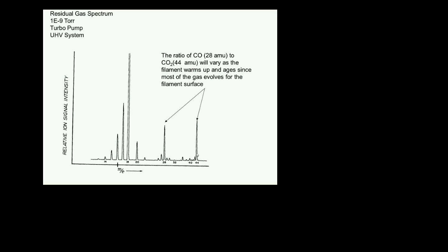And then he sent me a copy of the paper because he's a friend of mine. And I had to ask him, well, was there a lot of water in your spectrum? He goes, yes. So he had to write a retraction to the paper as a result of that. So the moral to the story is that very often when you look at a spectrum, at the background signals or even the regular signal you're seeing, some of the peaks are going to come from the interaction of the different chemical species in the system with the filament and with each other, creating peaks that you won't necessarily expect, but that can always be explained in terms of chemistry.